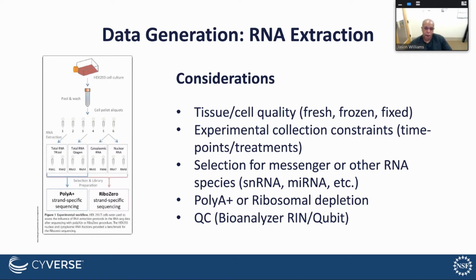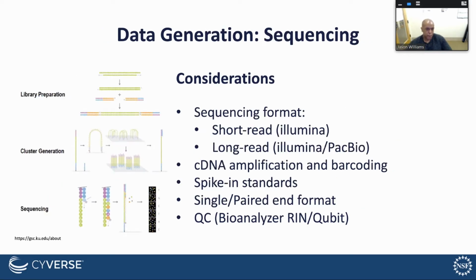I would say for microbes, particularly prokaryotes, there probably are some differences that you need to pay attention to, because a lot of these protocols are specific, so make sure that you're using something that is specific if you're using a prokaryote. How things like polyadenylation work, or how ribosomal RNAs might be extracted from a bulk collection like a culture, may be different for you. So make sure that you are using something very specific.